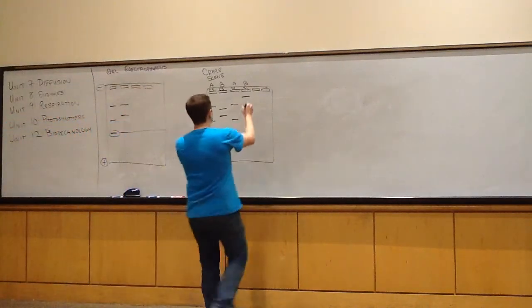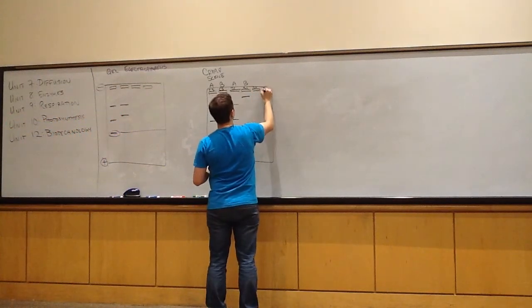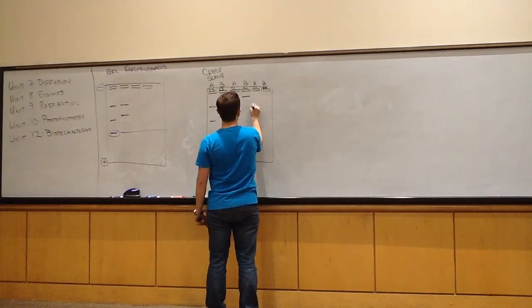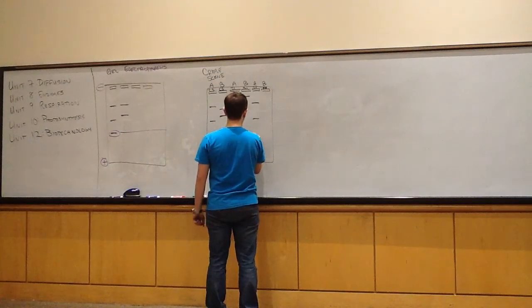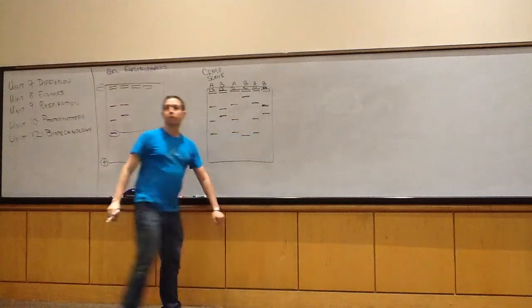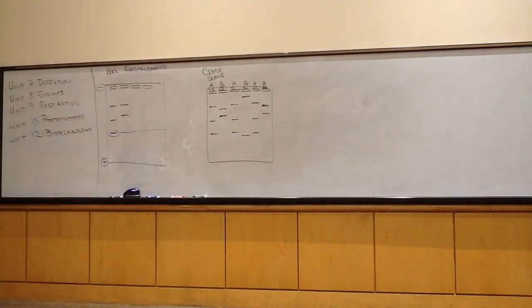Now let's say we do suspect 2, A and B, and suspect 2 looks like this. Guilty or innocent? Guilty, because there's a 100% match when I digest that DNA with enzyme A and with enzyme B.